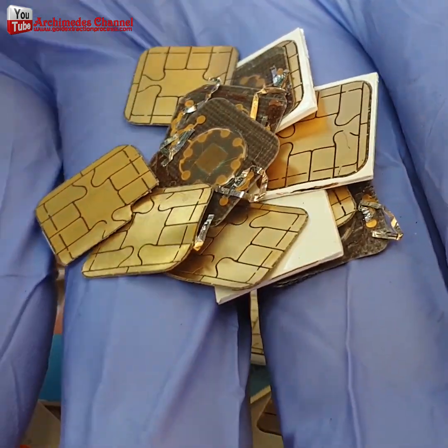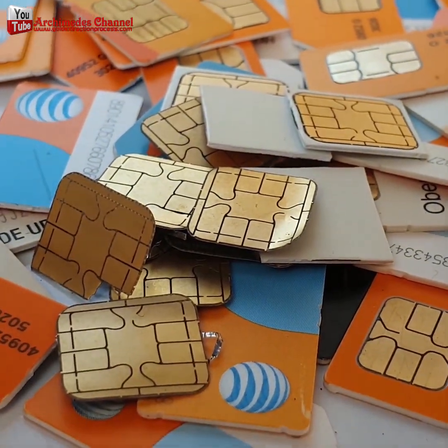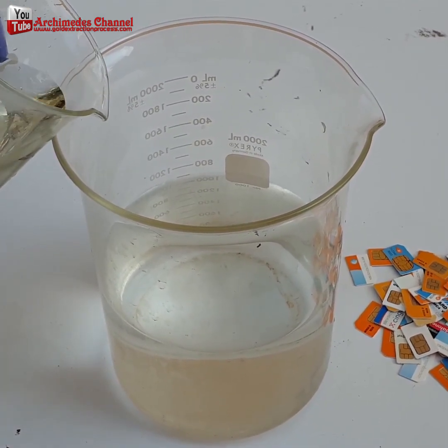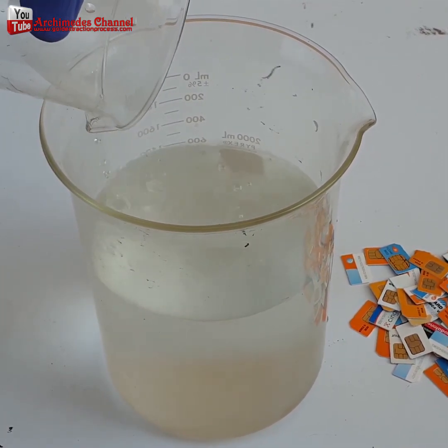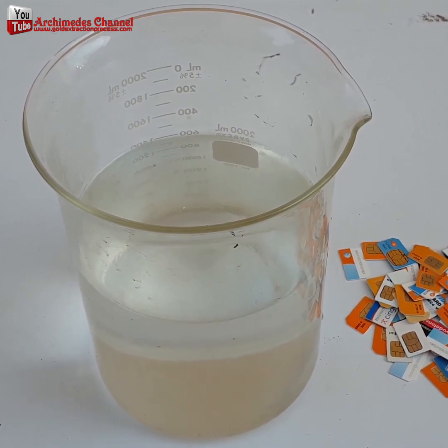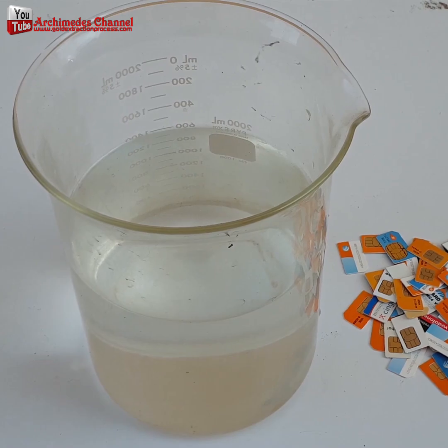Today I will recover gold from my SIM card cell phones. The key problem is the collection of enough quantity for gold recovery. We use 68% nitric acid, mixed at a ratio of 1 to 1 with water, to remove metal and separate the gold from the contact area of the SIM card.